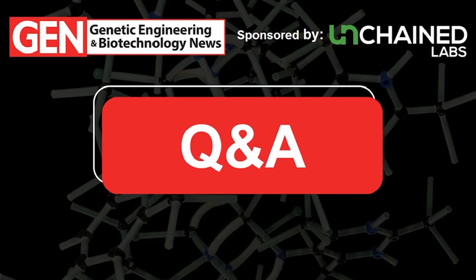But again, there are lots of different methods that can determine aggregates, such as the one we're doing here. And there are some that are very sophisticated that really give a clear picture, and there are some that give you an idea of what you have, as we have shown here with Stunner. So the idea is that you have a lot of tools. Pick the one that you want to use, and then stick with it, so that you're able to correlate the data.